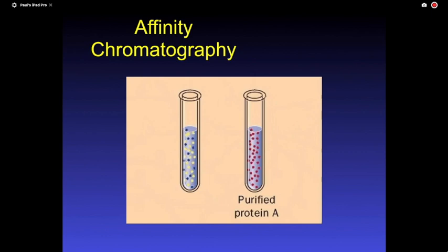So you have one protein, but you have the other stuff in it, you will have to do an extra step. And all of these, even like your protein that was on the ion exchange, you put salt in there. When you get your pure protein, you've actually got salt. You'll have to desalt it using gel filtration or dialysis. So there's always another step.